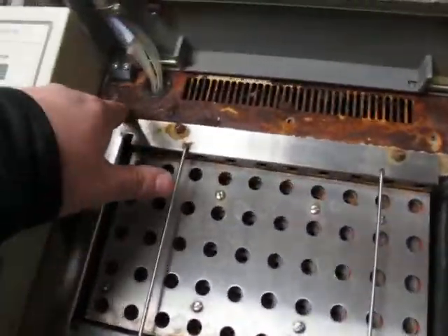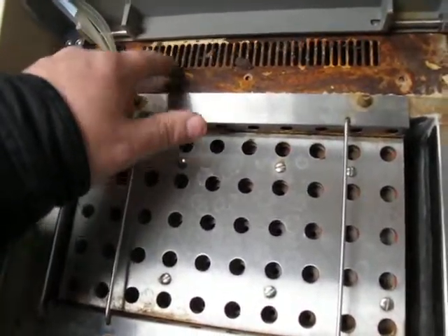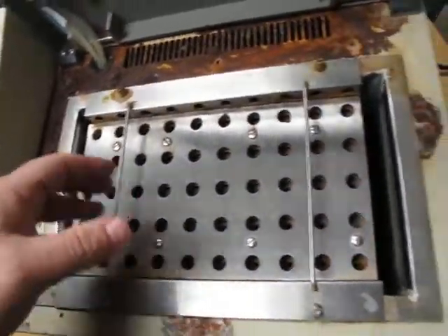There's a little bit of corrosion here, some flaking. Might be able to be cleaned up — take this apart and paint it.